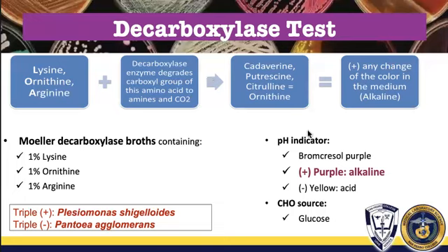Okay? So Bromcresol purple is activated again to change the color of the medium from yellow to purple. Okay? So purple, yellow, purple is the color reaction of our decarboxylase test. We also observe the same with lysine iron agar when we do decarboxylase testing.